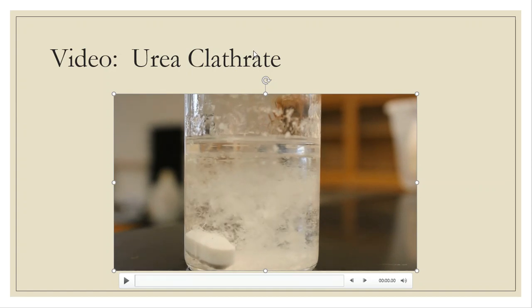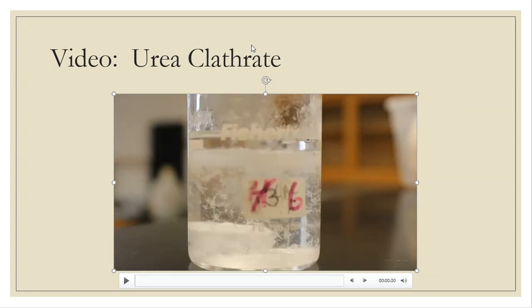Okay, so I want you to pay attention to the observations here. The very first thing that I will say is look up here. What do you see? That area is going to be somewhat important because it does look like I do not have just one layer here. It looks like there's something that's separating up here on the very top.